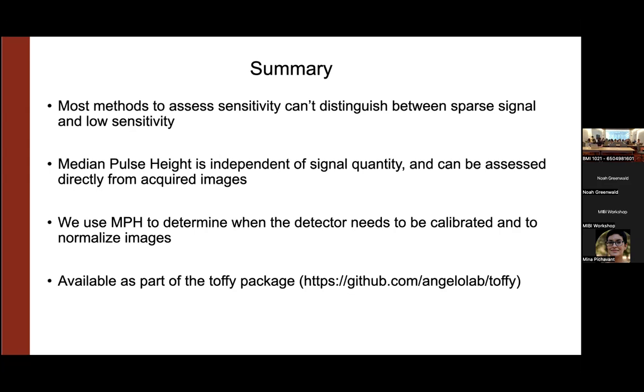Okay, how different are the MPH values for each channel? So, I mentioned that we do this step of fitting the MPH over the course of the run for each channel. The reason we do that is because the relationship between MPH and total counts and proportion of maximum counts doesn't change. But at a given snapshot in the detector's life, different channels will be at different MPH values.